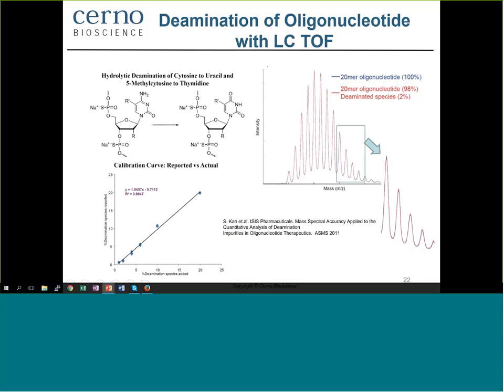If you look over here on the right, I've blown up a section of the mass spec, and what it's showing is, again, the fitting, the overlay of the mixture spectra. So it's a linear combination of the different deaminations here with the measured data. And again, we're using that spectral accuracy. By the way, all these are published papers, posters or presentations, and I've cited the references here in each slide.